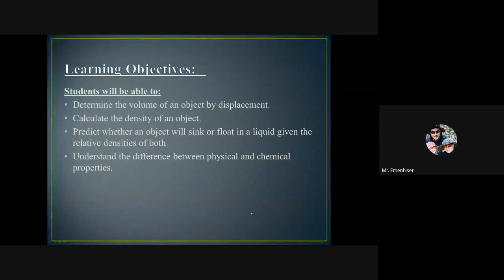All right, learning objectives. Students will be able to determine the volume of an object by displacement. You should already kind of know this. If I take a cell phone and put it in a pot of water, I'm going to watch as the water level rises. That's displacement. I can see how much volume the water rose, and I know that's equal to the volume of my phone. So that's displacement.